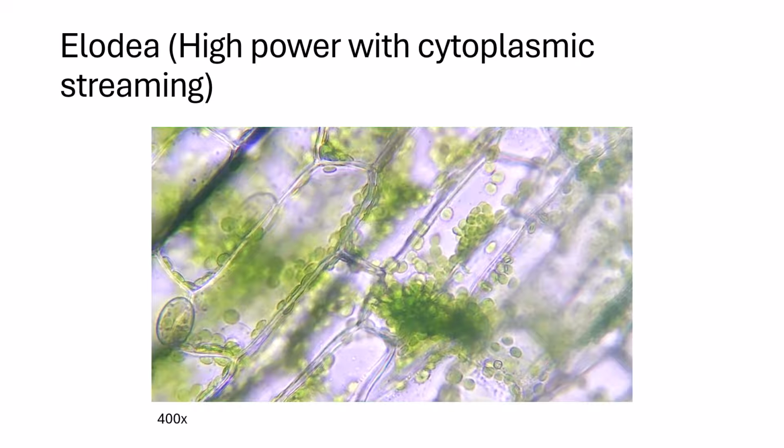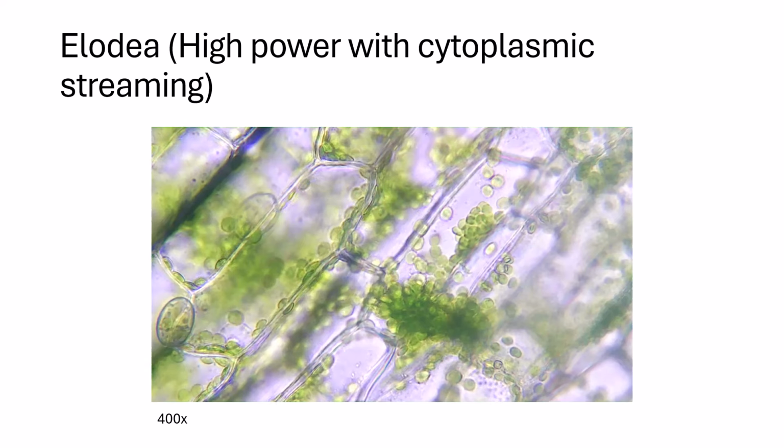If so, what might that tell you about the vacuole? Do you notice any movement? Are the chloroplasts staying still or slowly shifting? The movement of the chloroplasts around the vacuole is called cytoplasmic streaming. Where is the cytoplasm located? Is it spread evenly or mostly along the edges of the cell? Can you find the nucleus? If you can't, what might make it difficult to see in this cell without staining?